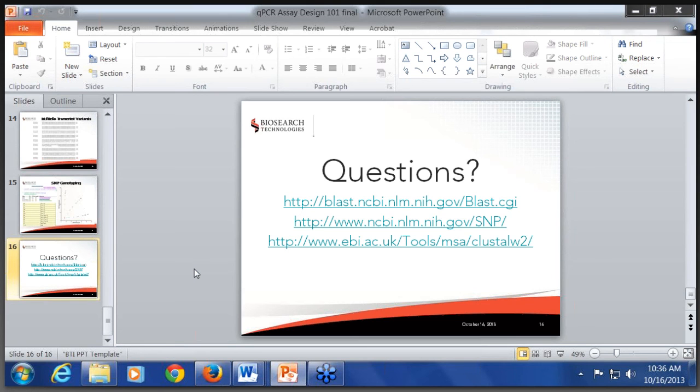Okay, thank you very much, Lou. That was a really great presentation. Those BHQ probes in the real-time design software look like a great package. They make qPCR assay design a lot easier and more flexible. I think you did a great job of demonstrating that there.